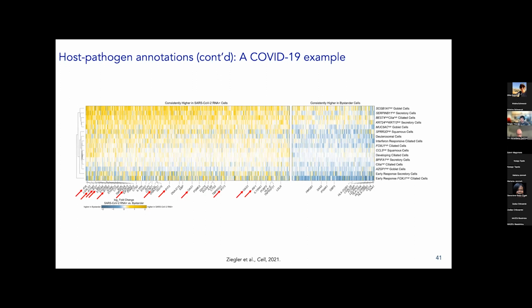Then when we map the transcripts, they will be mapped to the host genome and to the pathogen genome. And then we can have a matrix with the genes from the host and the genes from the virus or the pathogen. Again, this will only be for polyadenylated viruses or eukaryotic pathogens, but yes, we can differentiate them based on where they map with the aligner, whether they map to the host genome or to the pathogen genome.